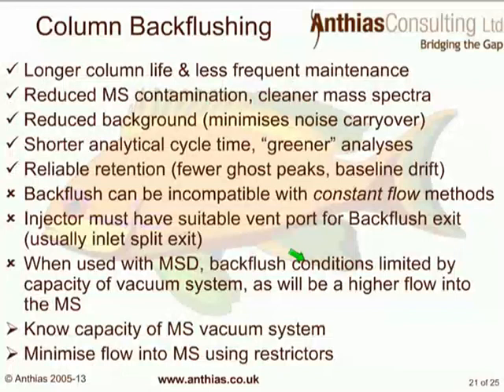So if we use column backflushing, it will give us a longer column life. Therefore, the less volatile compounds are less likely to damage the stationary phase, and also less frequent maintenance. It will reduce the contamination into the mass spectrometer and give us cleaner mass spectra. It will reduce the background, so we will also minimise the noise carryover.